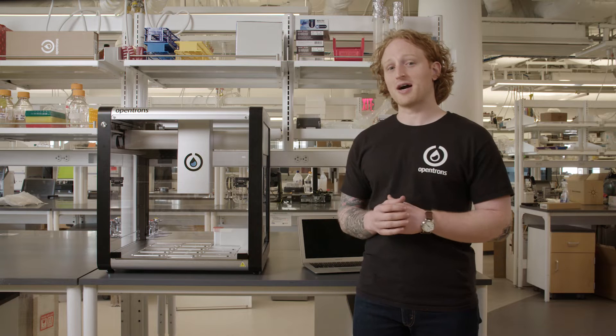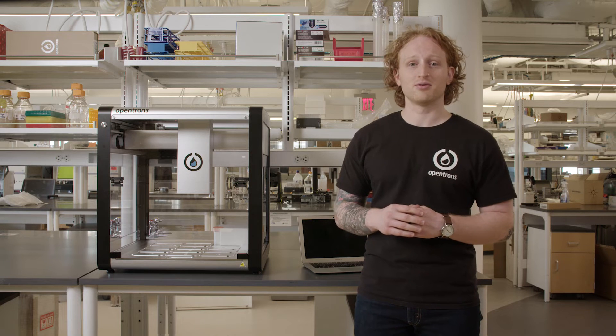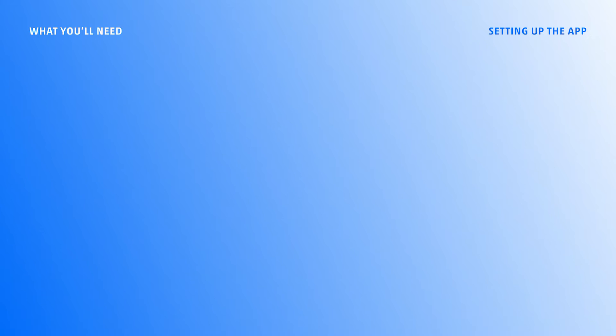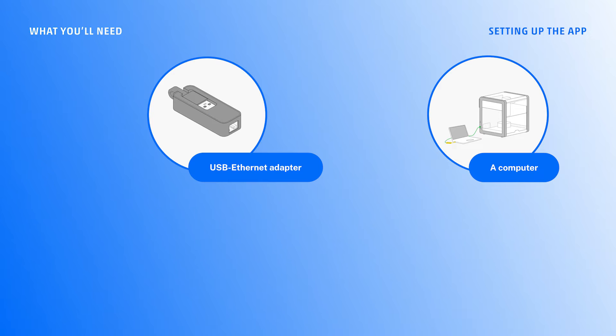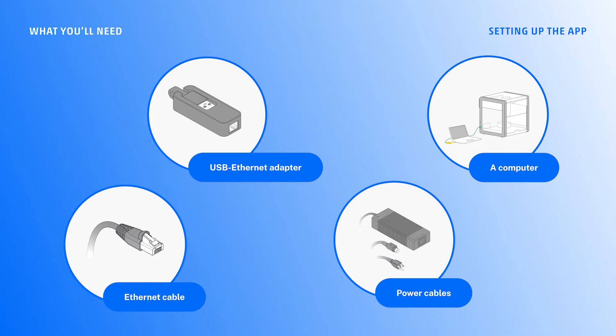Since I have already unboxed and unlocked the OT2, all I need this time is a computer, a USB to ethernet adapter, an ethernet cable, and the power cables that were included in the larger foam enclosure and the accessories box.